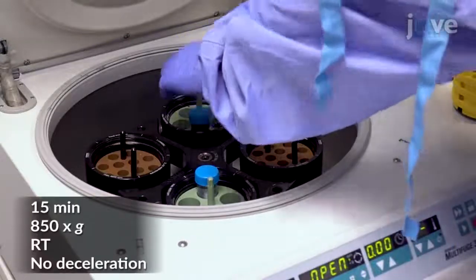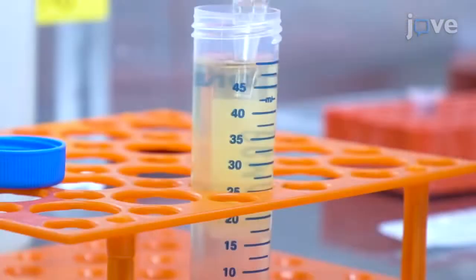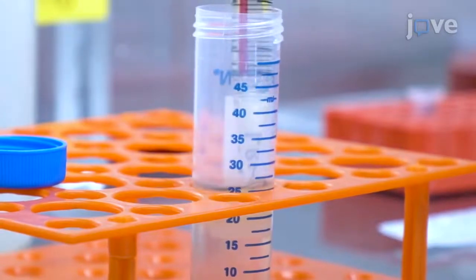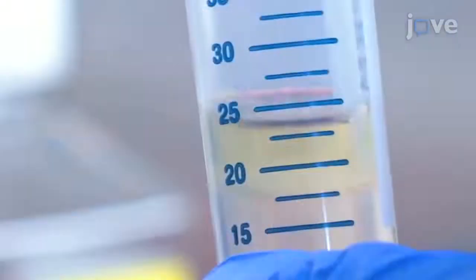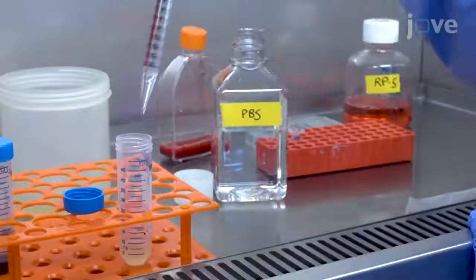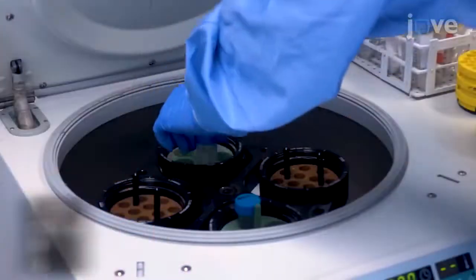Separate the cells by density gradient centrifugation and remove approximately 20 mL of the resulting top plasma layer. Then collect the white blood cell layer, taking care to avoid the red blood cell pellet, and wash the cells three times in fresh PBS.